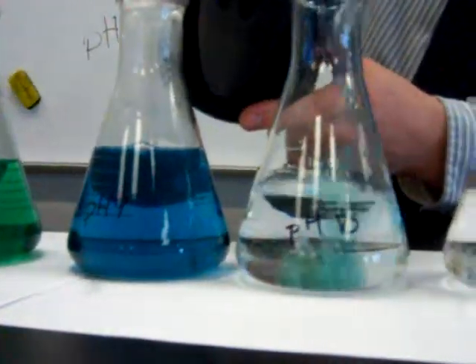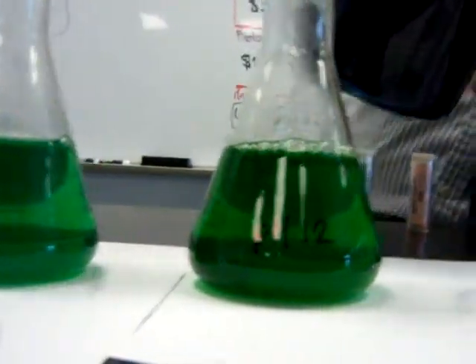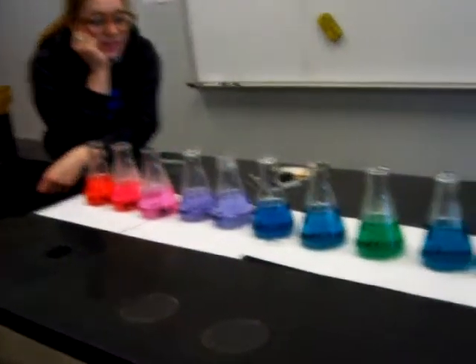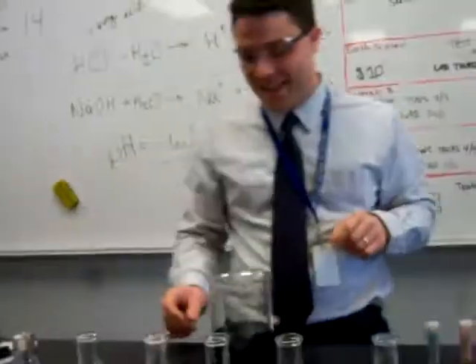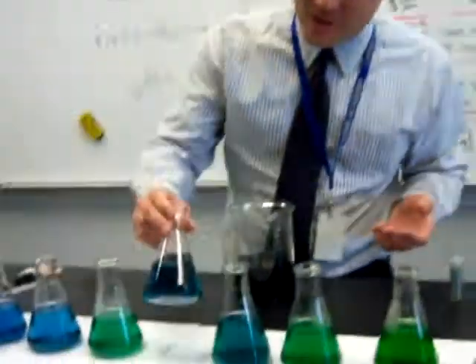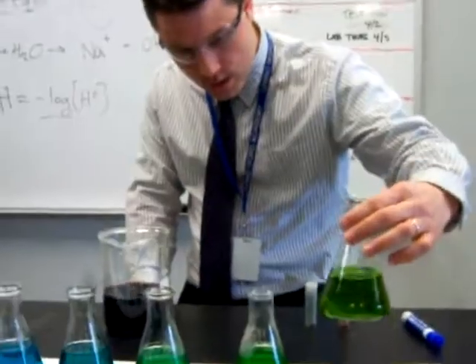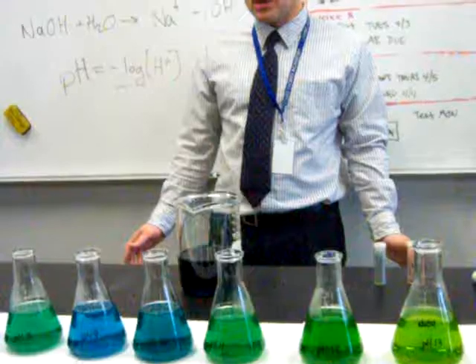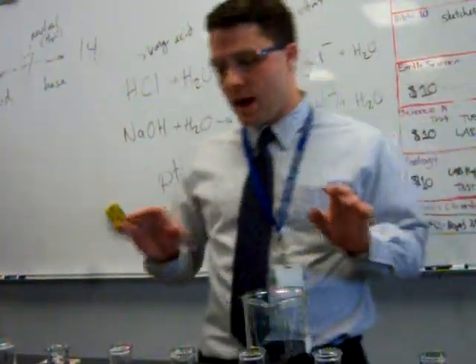Something went wrong a little bit — oh, it's pretty. Come on, yellow. This should be lighter; something's not right. You can just switch those to make the rainbow better. Maybe I labeled them wrong. This one should be more greenish. Anyways, you see what happens here — this one is approaching a yellowish color. The only difference is we've got water, cabbage juice, and just a different amount of acid or base. That's it.